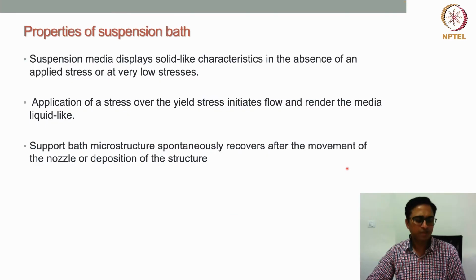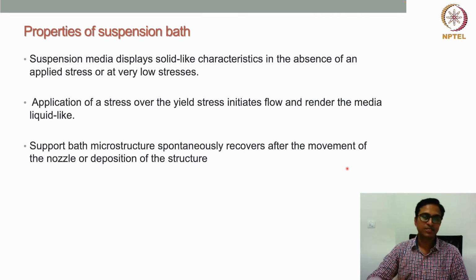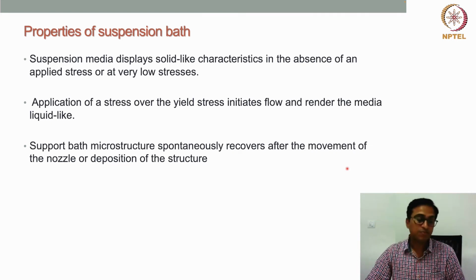Now what are the important properties of this support bath material? This support bath or suspension media displays solid-like characteristics in the absence of an applied stress or at very low stresses. Right? So that is the very first thing you should remember. The very first important property of the support bath material is that it should not just flow without any applied pressure, or at very low stresses it should not flow.